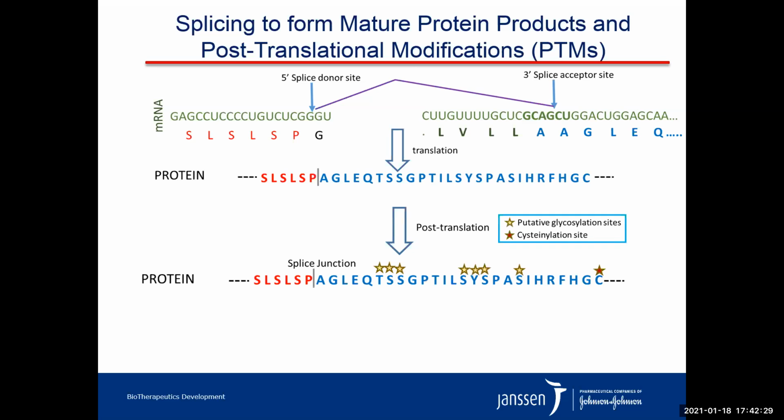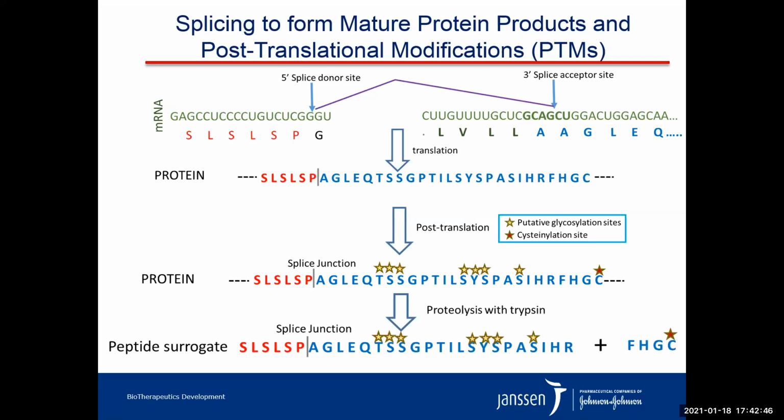The sequence also shows several patches of serine and threonine residues and a C-terminus cysteine that can potentially be capped with cysteine or glutathione. And the serine and threonine residues can be potential sites for glycosylation. Our database searches can now identify surrogate peptides or tryptic peptides mostly with both O-link and cysteine modifications based on this in silico prediction.